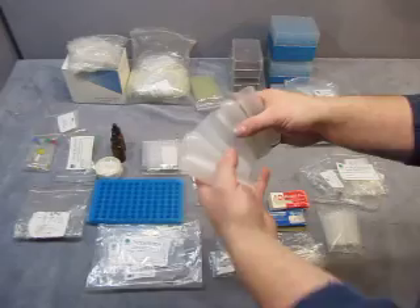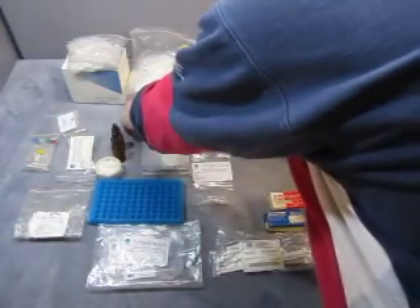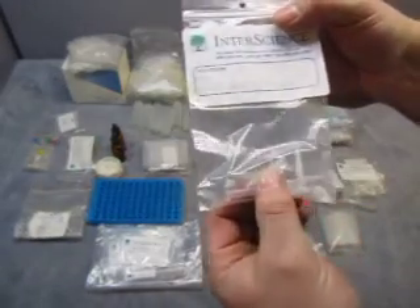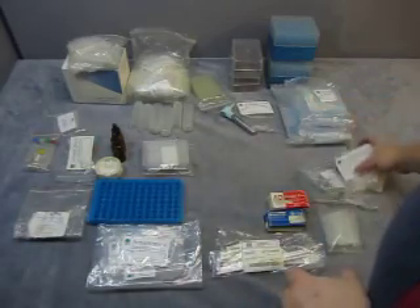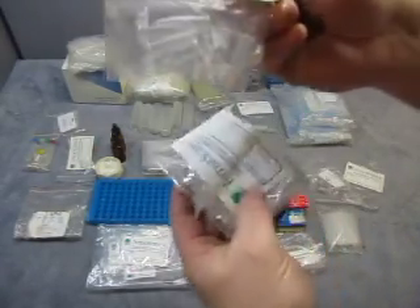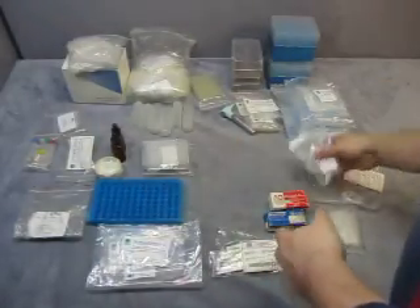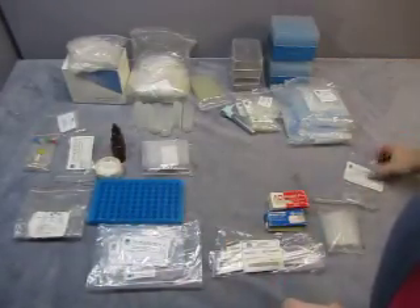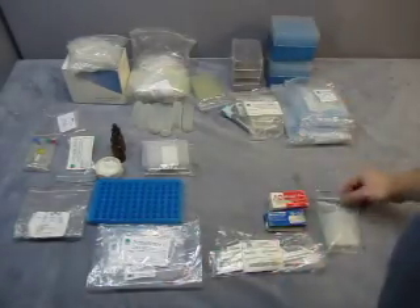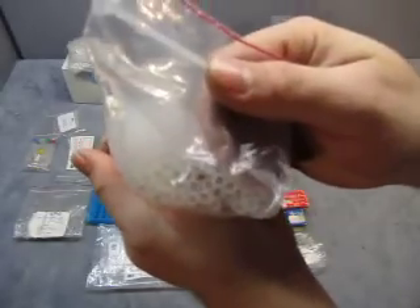Then you get six cylinder things for holders. These are 0.25 milliliter tubes — there's like five of them in here. Some more tubes, some more tubes, and then some more. There's a conical tube in there too, and a baggie of 0.5 mL with caps. Some more 0.6 mL, and some more tubes that are smaller than the other ones.